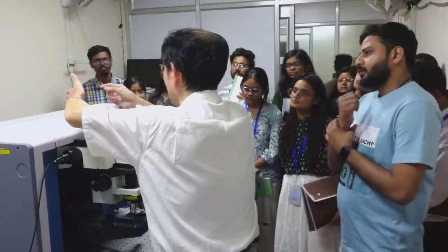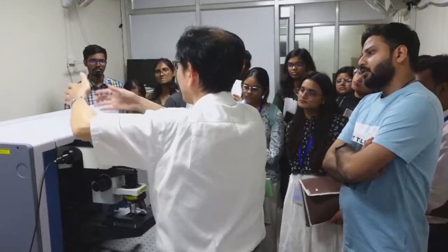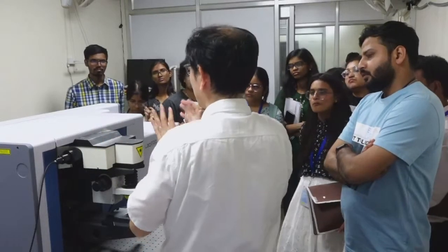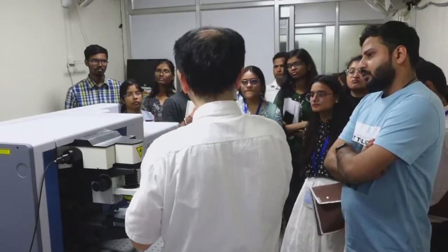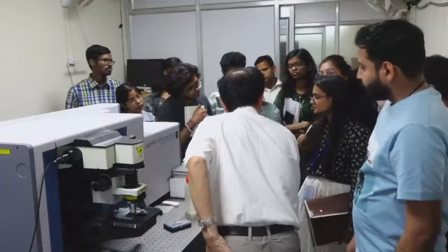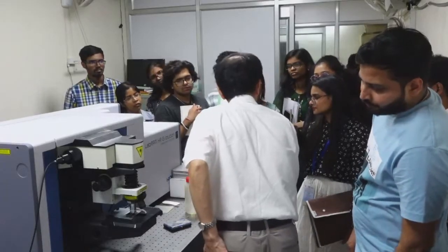So if we want to measure the low frequency Raman, another element is necessary. But 200 wave number is low enough for daily or typical use. Starting up, there is a need of signal collection.